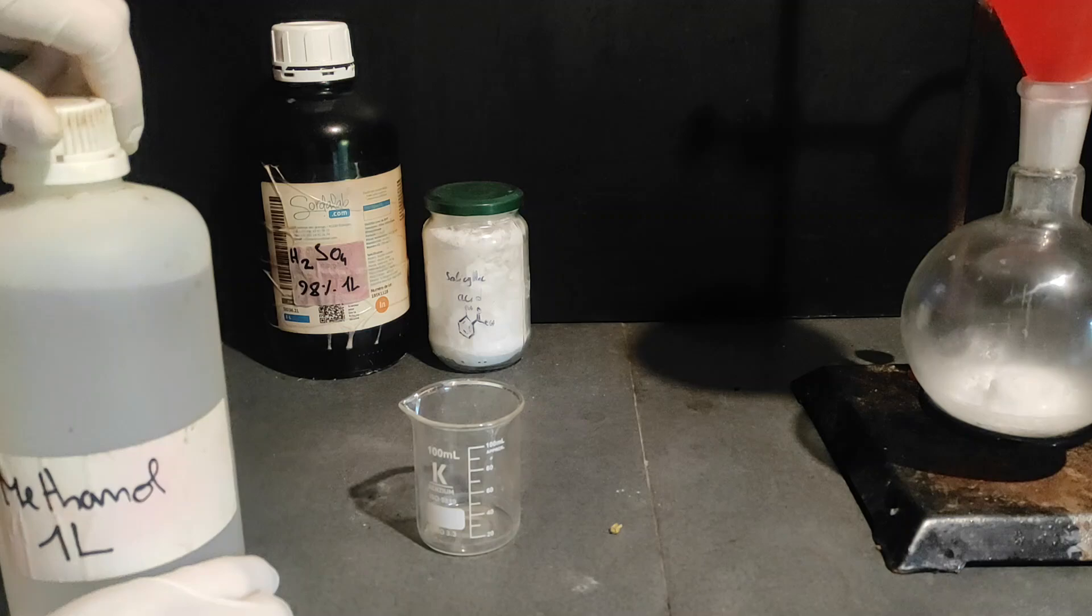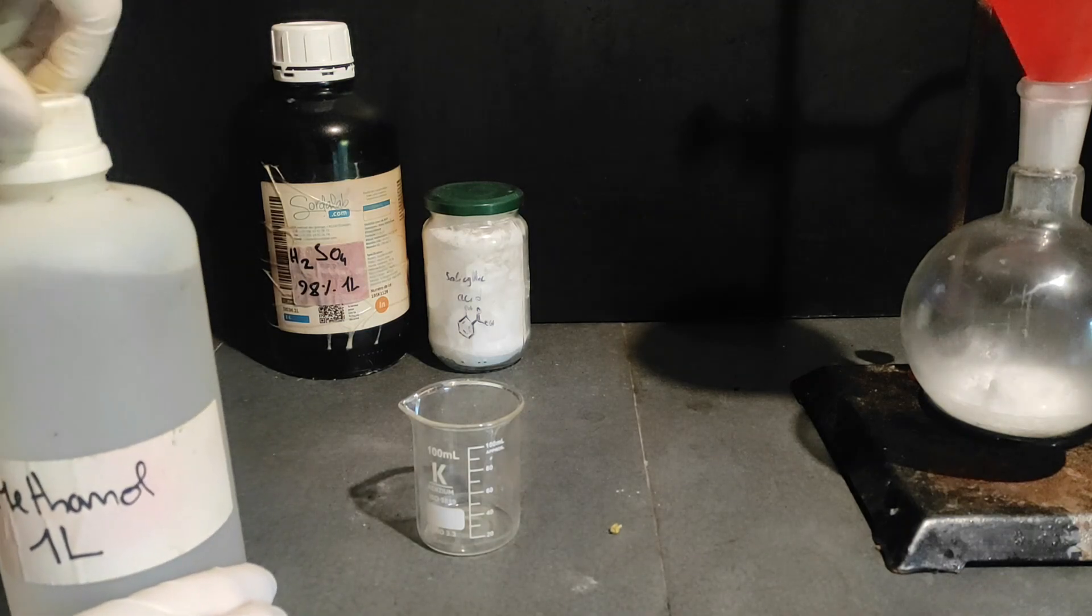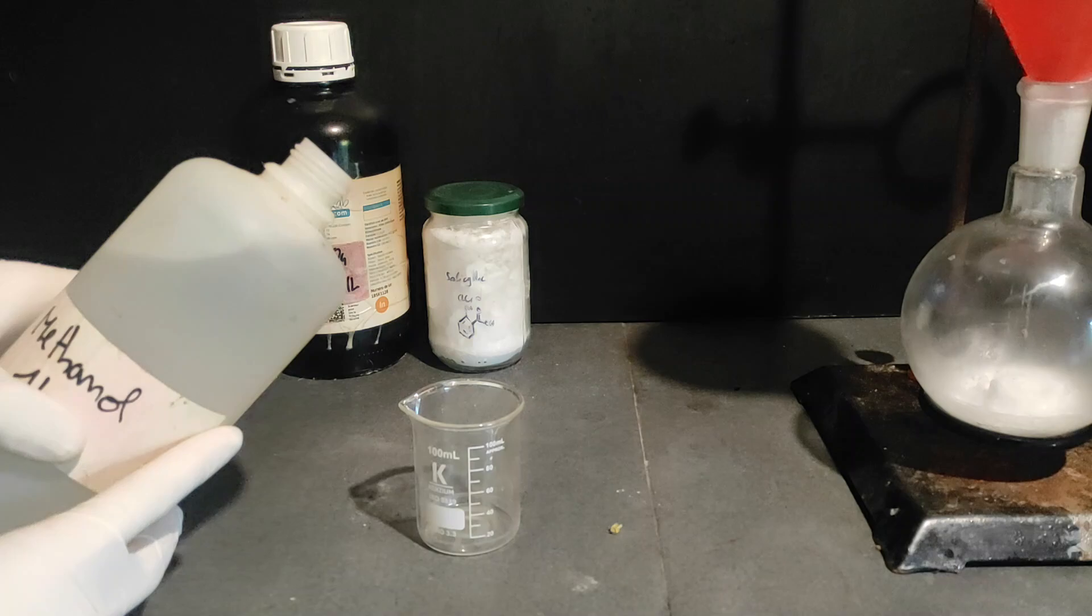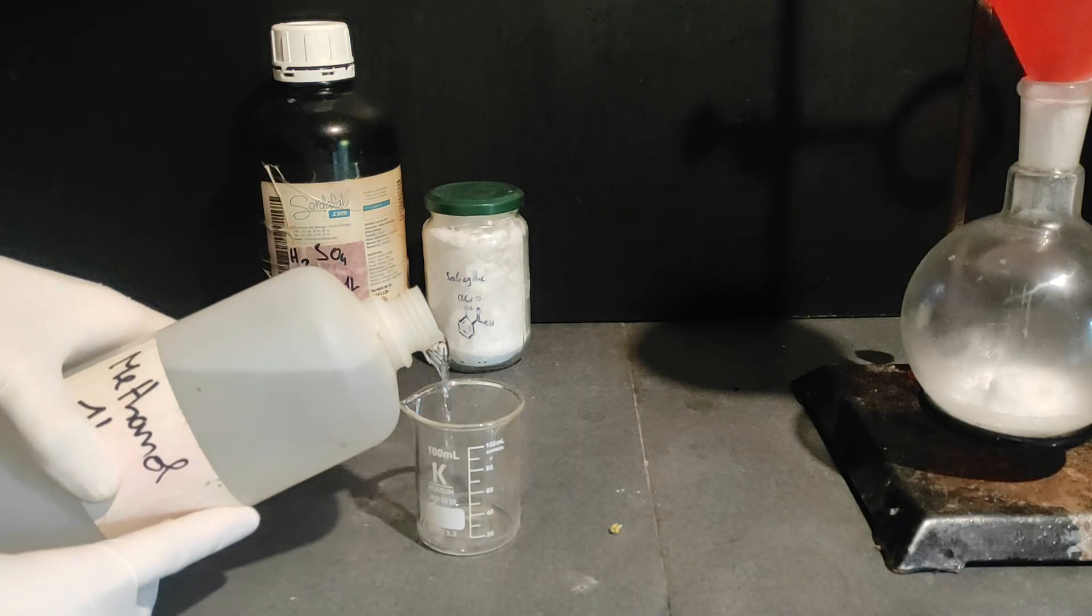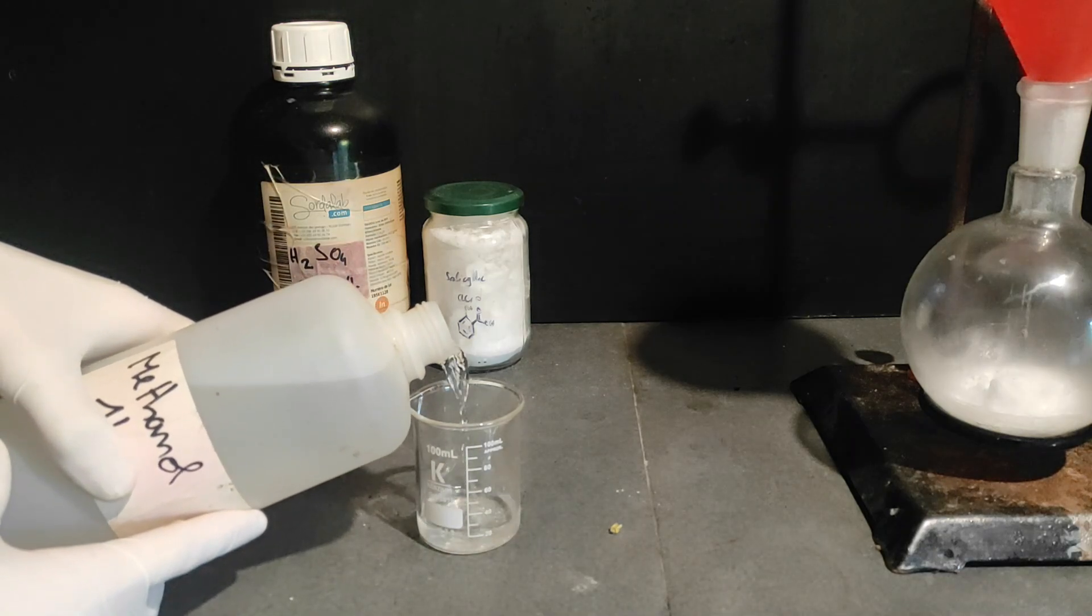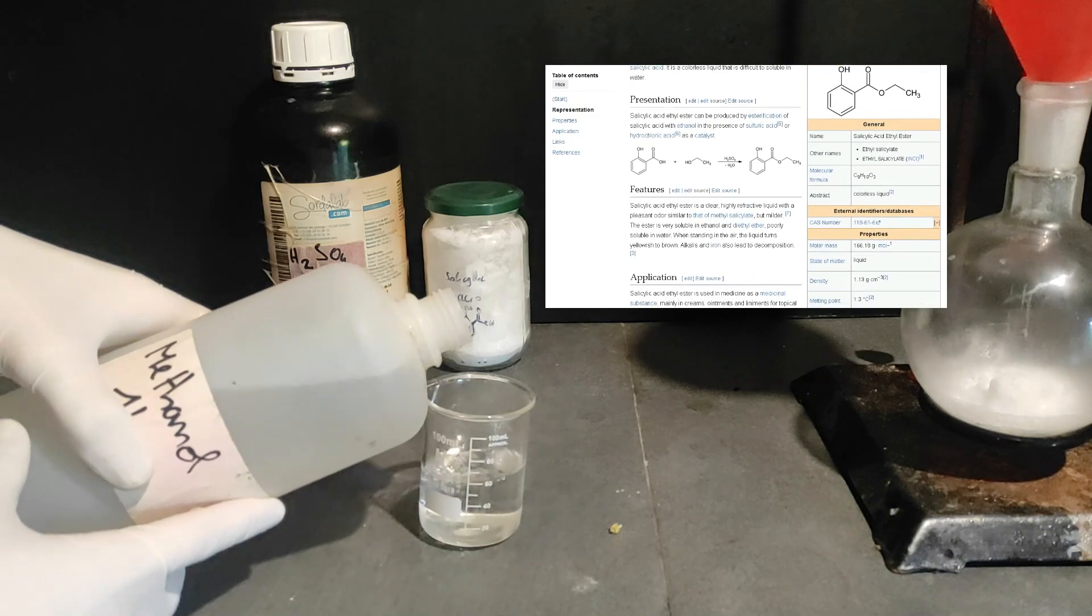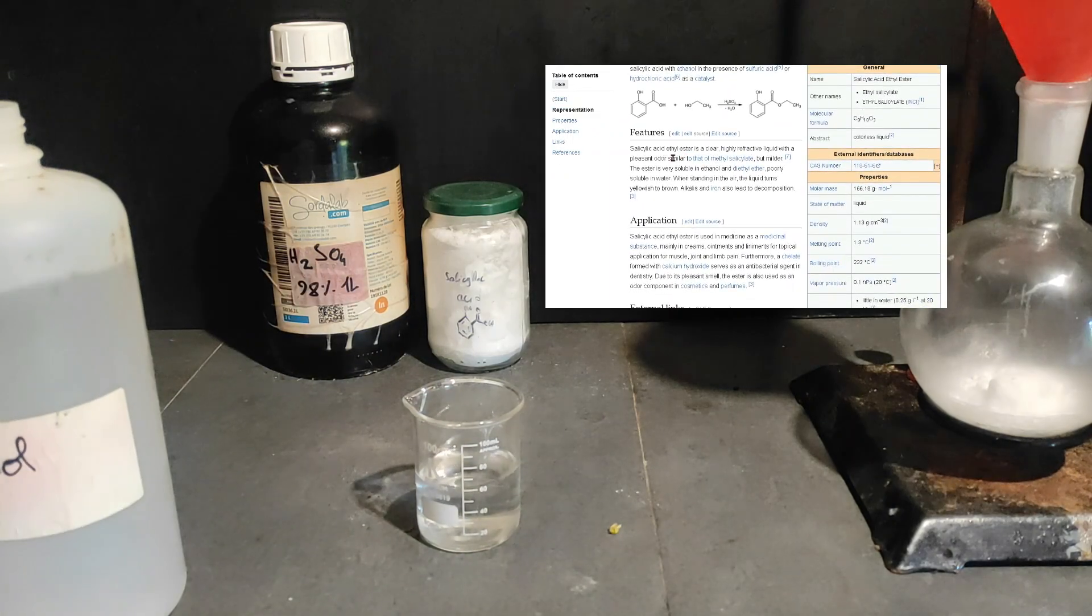Then we take a small beaker and measure 60 milliliters of second reagent which is dry methanol. If you don't have any methanol, you can also use some 90% or more ethanol to make a very similar ester called ethyl salicylate. According to Wikipedia, the smell is pretty similar, just make sure your ethanol is dry enough.